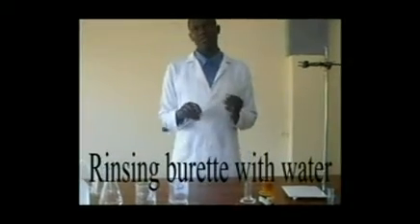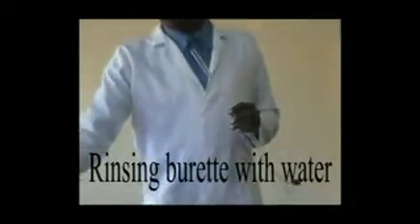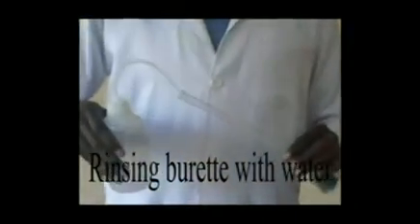Let's continue with another part, the procedure. Welcome to another part, which is the procedure part. In titration, the following procedure must be considered. First, you take the burette and rinse it with distilled water. Rinse it again with the acidic solution, which is the hydrochloric acid, in order to remove impurities which can affect the concentration.